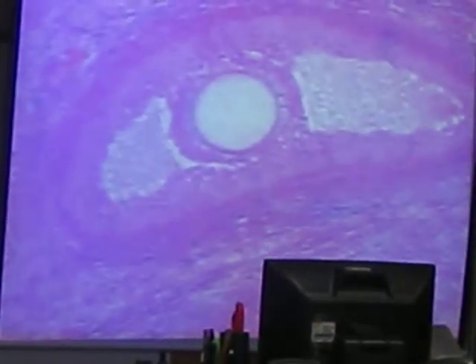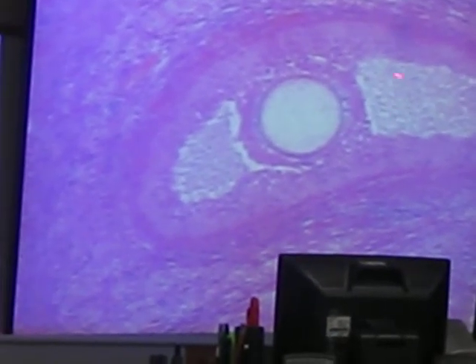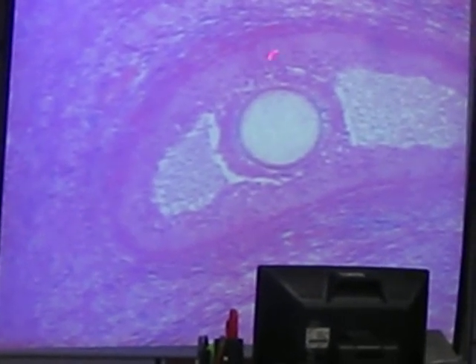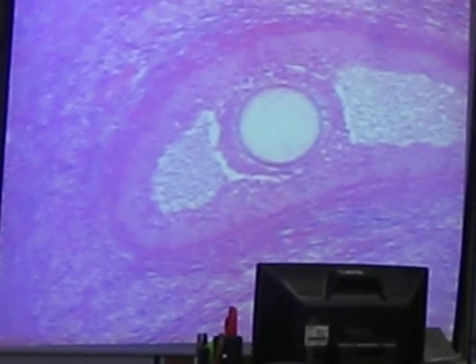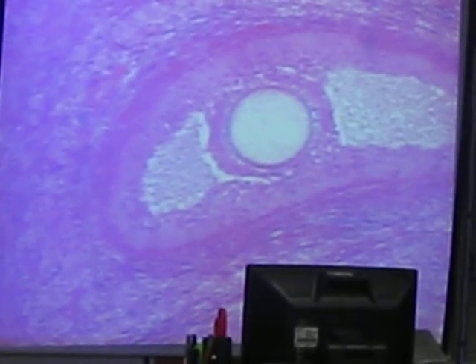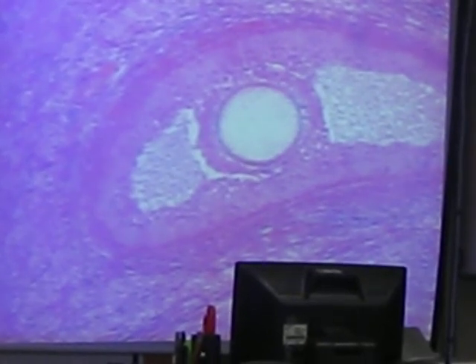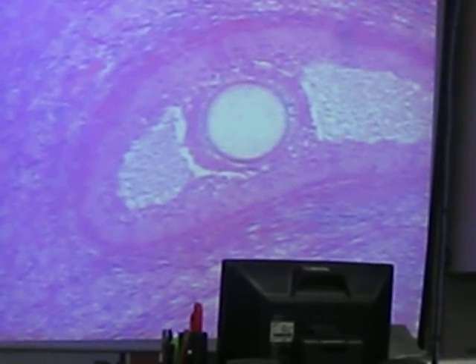follicle starts producing a fluid-filled cavity. You'll start identifying the formation of this fluid-filled cavity called the antrum. You still have the developing oocyte in the middle, the thickening of the follicle wall, and the formation of the fluid-filled antrum that begins to form around that oocyte. This is still a primary oocyte, still in meiosis 1, but now in the secondary level, it's towards the end, say anaphase and telophase 1.